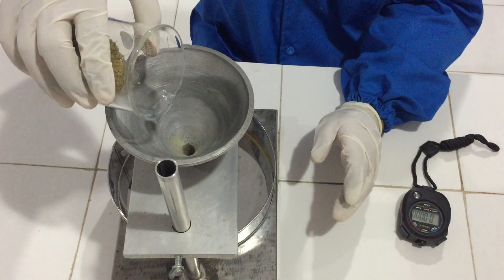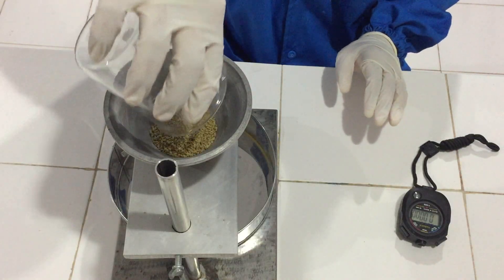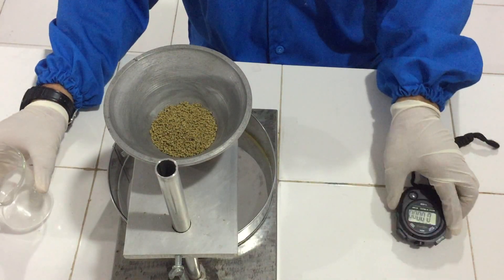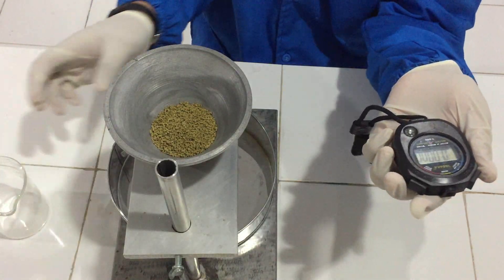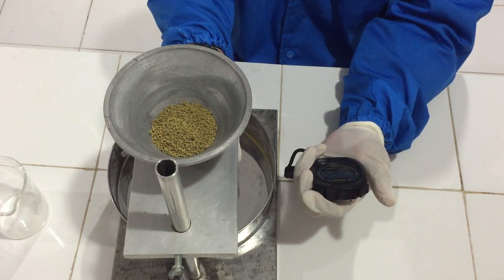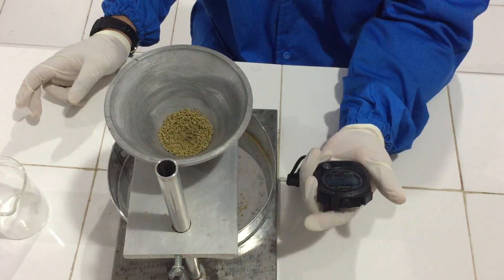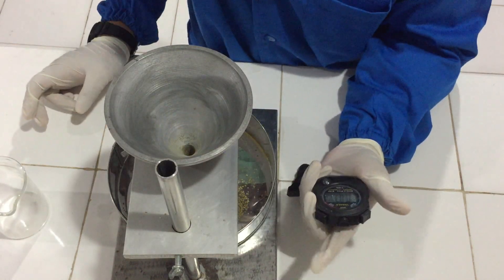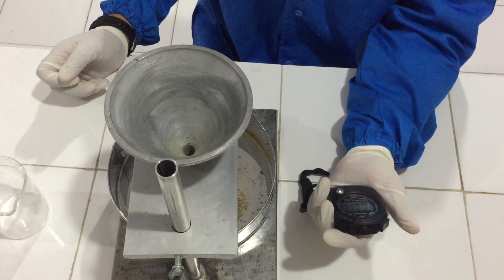Kita masukkan ke alatnya, sudah ditutup. Kemudian kita menggunakan stopwatch untuk mengetahui laju alir pada granul tersebut. Sambil bersamaan kita buka. Disini kecepatan alirnya adalah 3 detik. (We insert it into the device, it is closed. Then we use a stopwatch to determine the flow rate of the granules. We open it simultaneously with the stopwatch. The flow rate here is 3 seconds.)